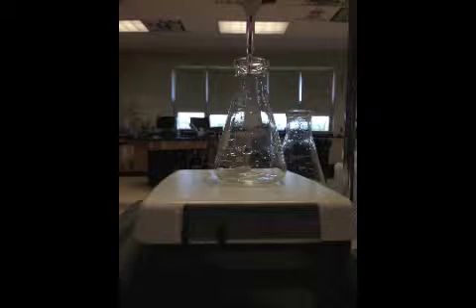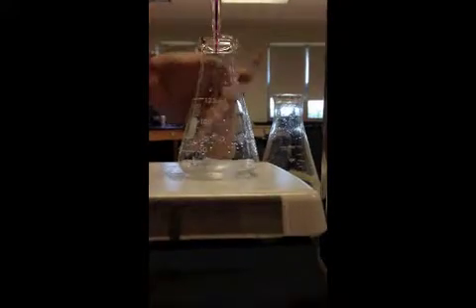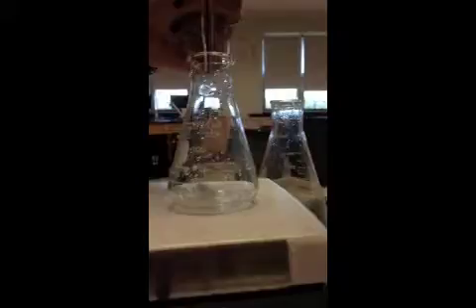This is how the second titration will be set up. The potassium permanganate will be in the burette and the H2O2 and sulfuric acid will be in the Erlenmeyer flask. Currently, we are titrating a solution of hydrogen peroxide 3% and sulfuric acid with potassium permanganate. We are titrating until a pale pink color is persistent in the beaker.